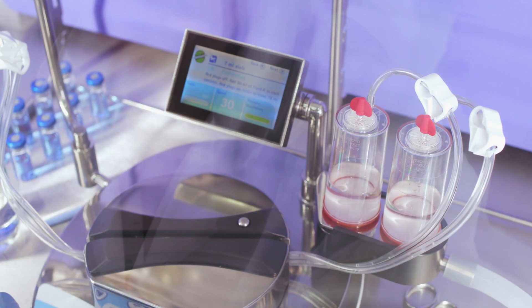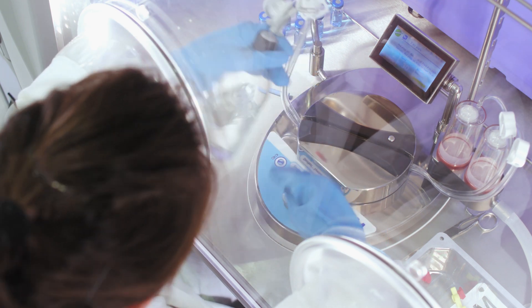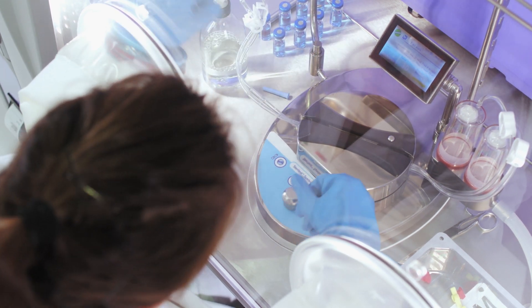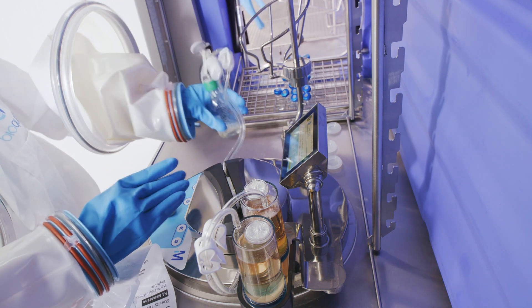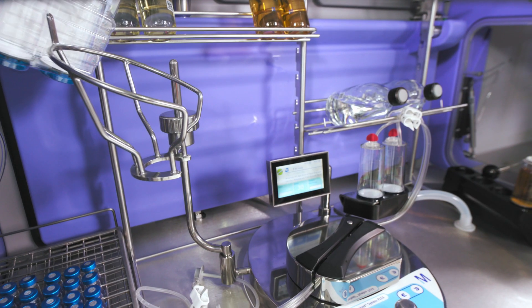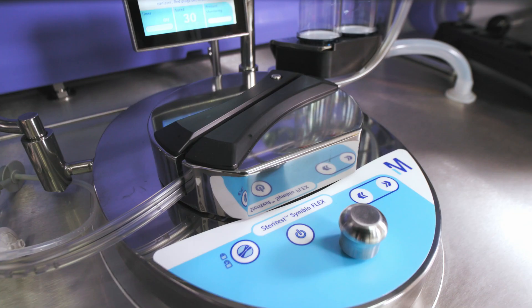Optional capacity for 21 CFR Part 11 compliant logging software is available as well. The flexibility of the BioQuell Cube doesn't stop at its modular capability and hydrogen peroxide vapor technology. It also offers seamless integration options such as incorporating the world's leading sterility test pump from Merck Millipore.